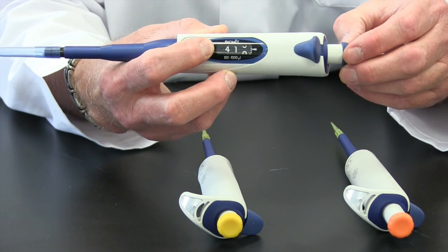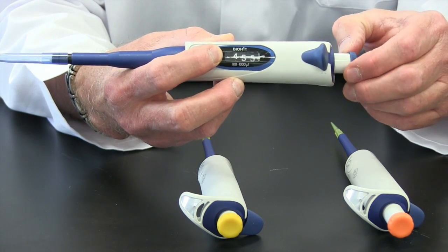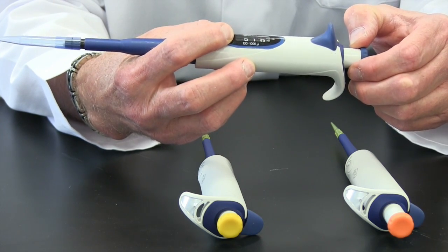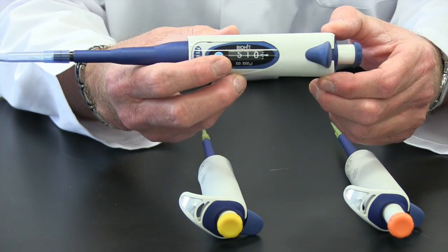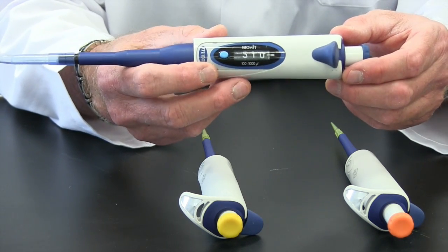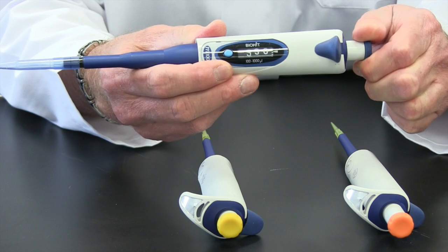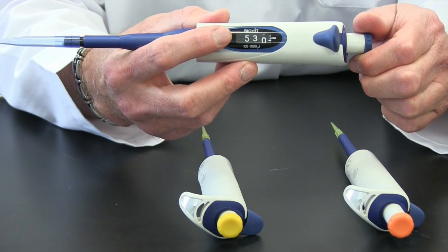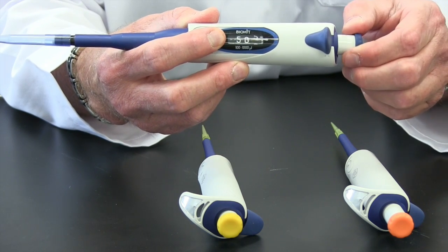The way it functions is, to change the volume here, you have to press in the lock button. And then you just turn the operating button on the top to whatever volume you want. When you have your set volume, if it's 510, you release the lock and it will stay locked in that position. If you don't press in the lock button, you'll be grinding against the lock, and that's a very bad thing. So make sure you press in the lock button to change the volume.